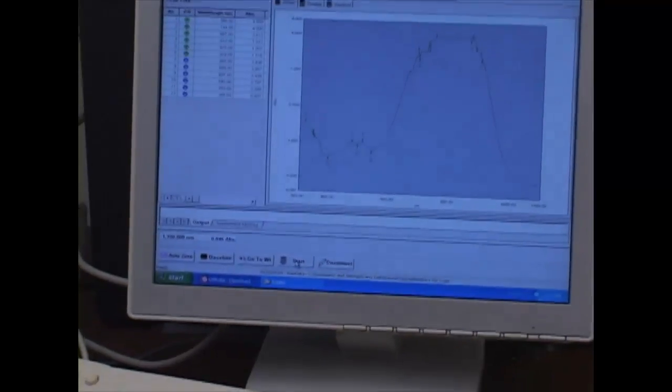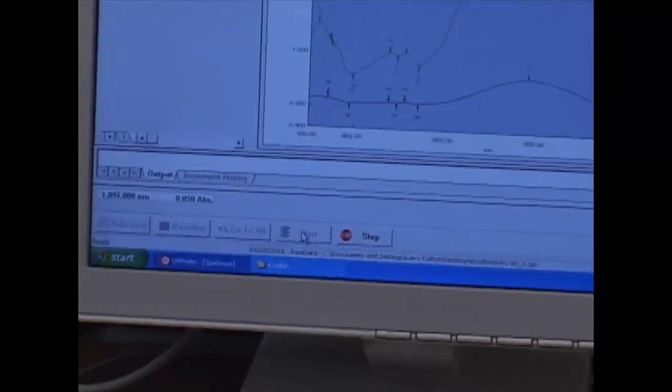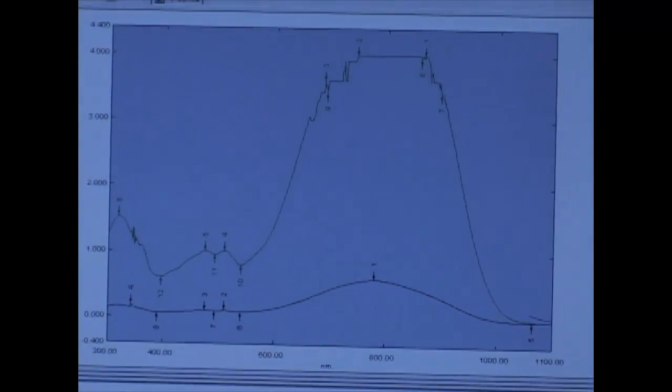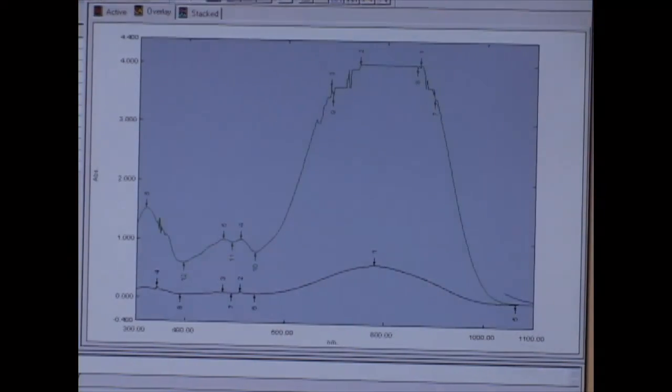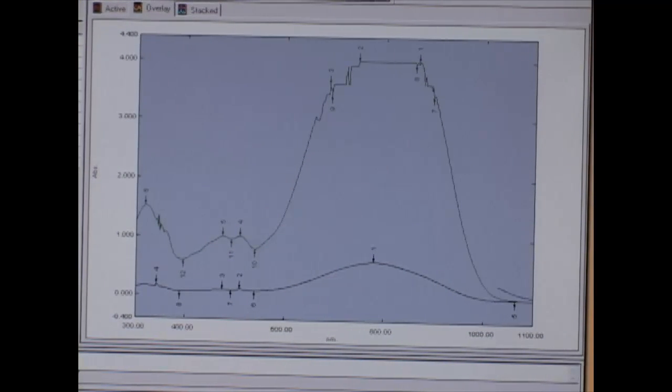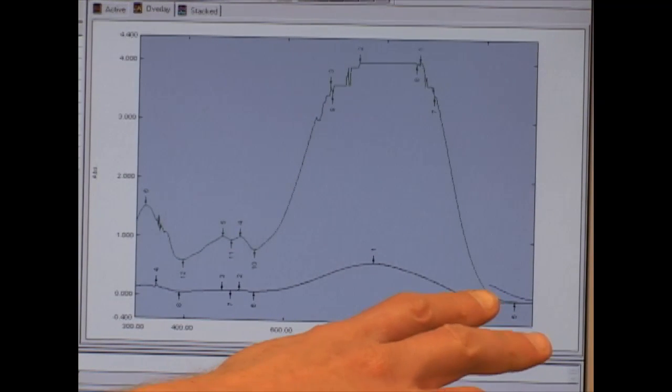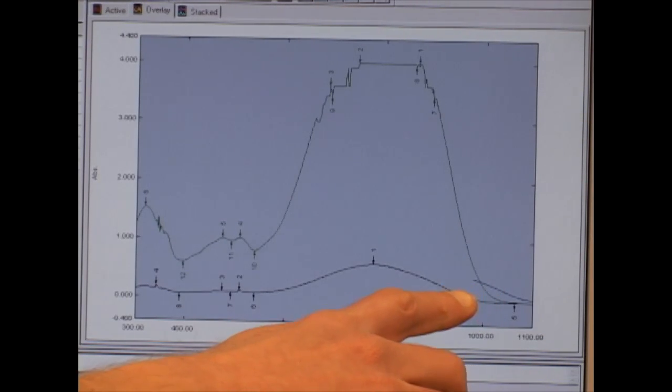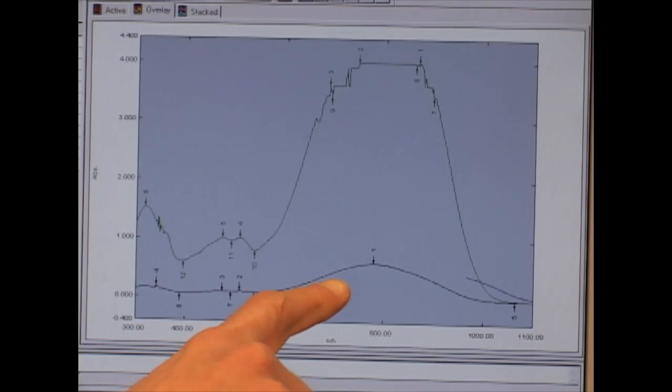Now press start and wait again. As you can see, this is the absorption of sample in thin film versus same material in solution.